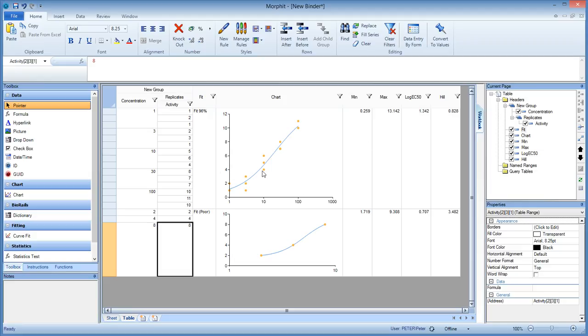So this concludes my first video on how to do curve fitting in Morphit, and I thank you very much for listening.